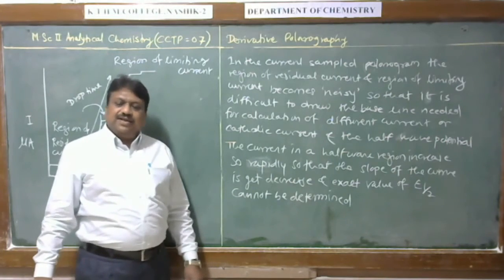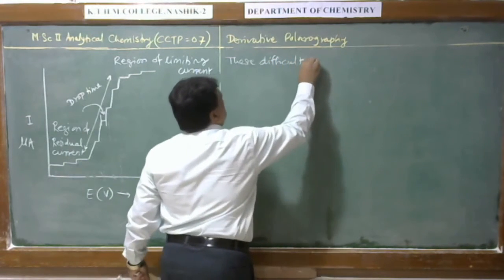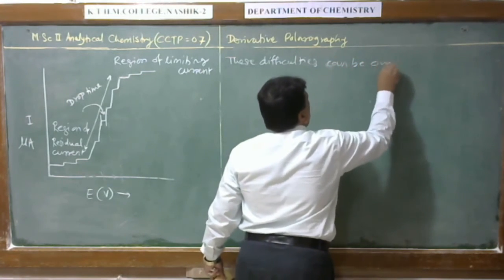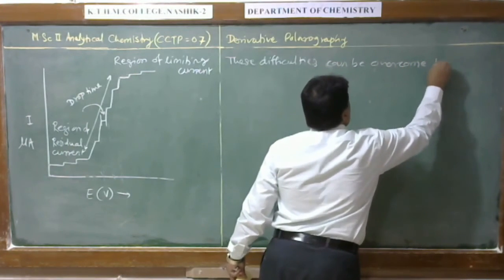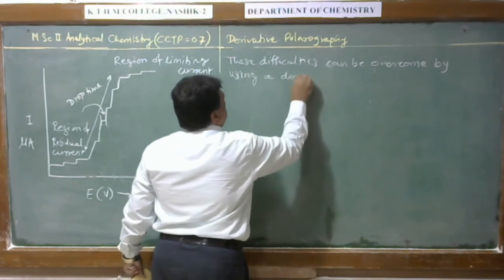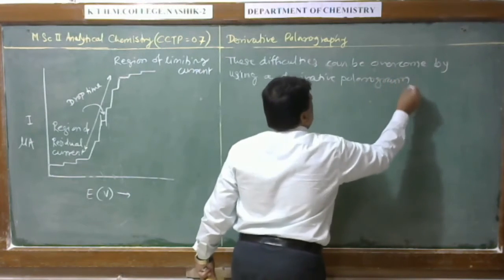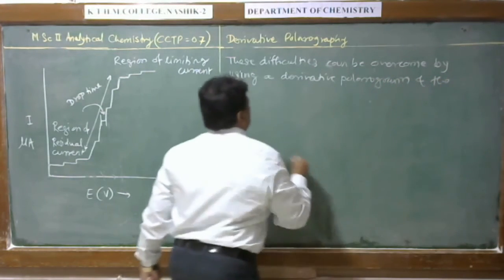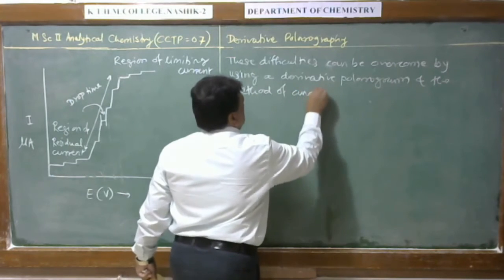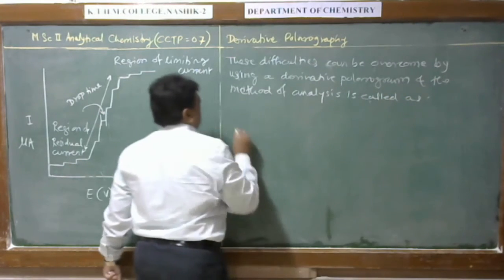So these difficulties can be overcome by using a derivative polarogram, and the method is derivative polarography.